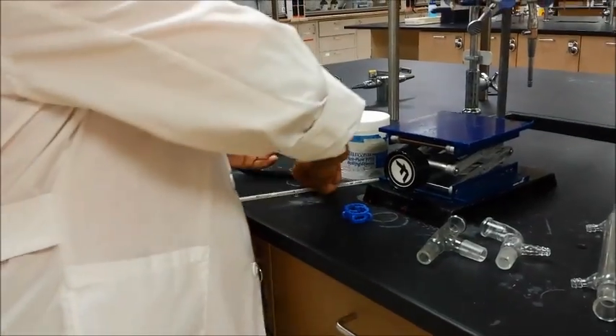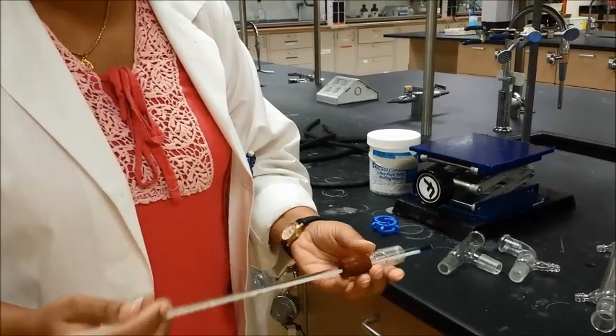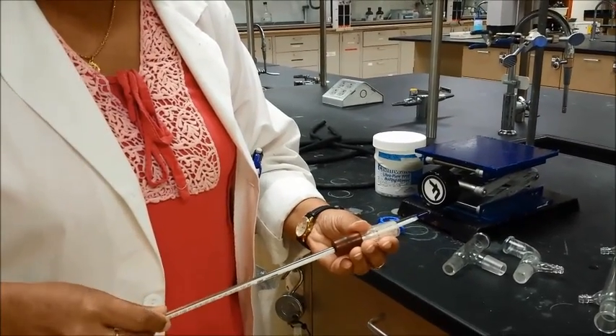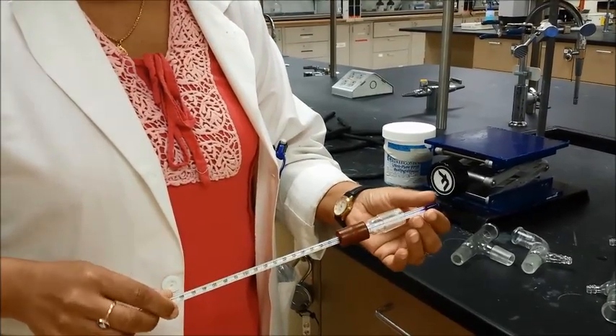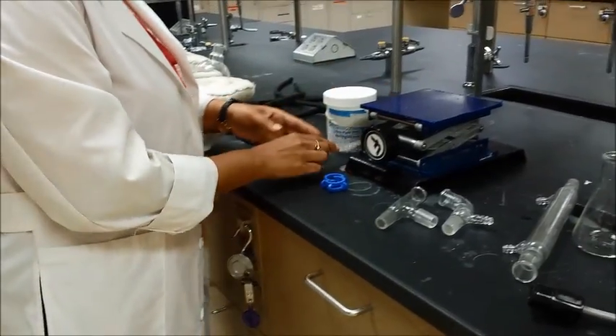This is where the thermometer is going to go. We're going to push the thermometer through like this. I will actually place the thermometer at the end, because I'm always afraid that the thermometer will roll off and break. So I use that at the end, not in the beginning.